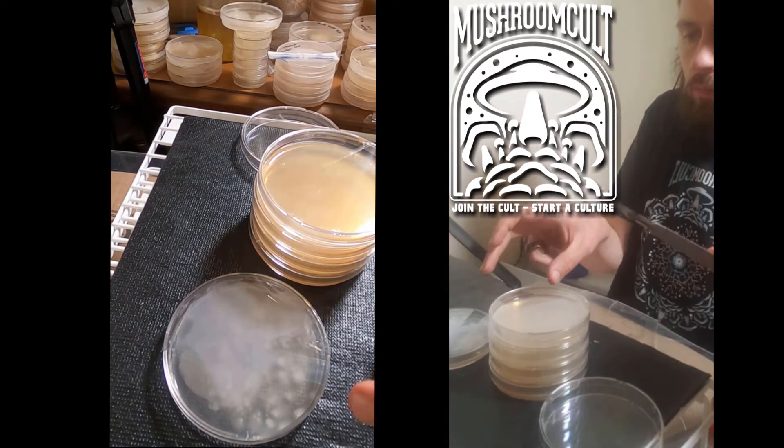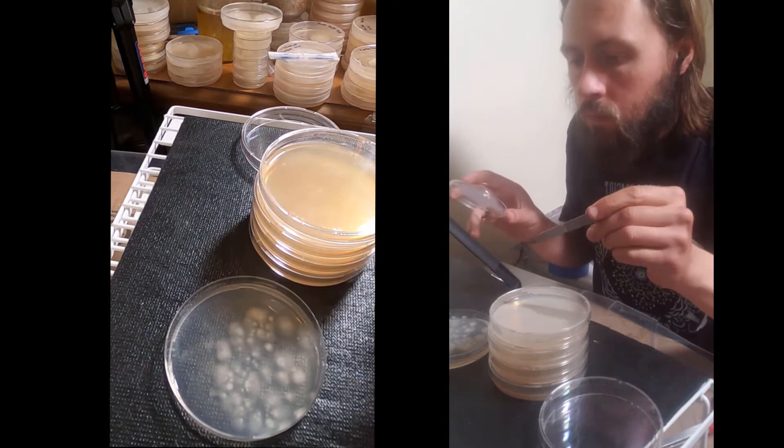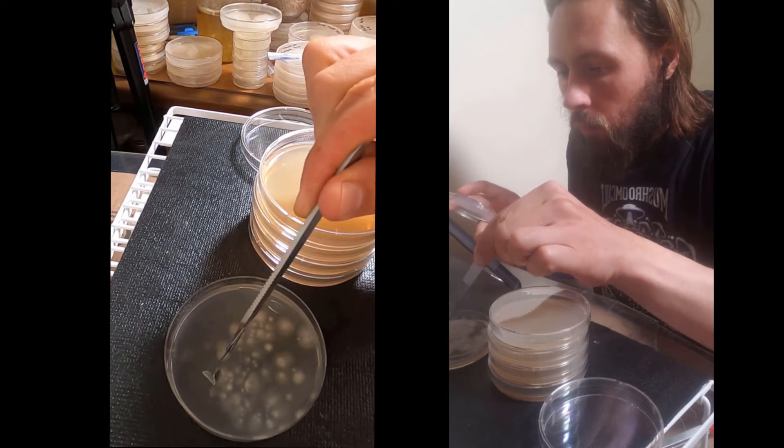Welcome to the Mushroom Cult. Today we have an eight-day-old spore inoculation and we are going to remove different sectors on specific colonies and put them on new plates in order to isolate a single strain.